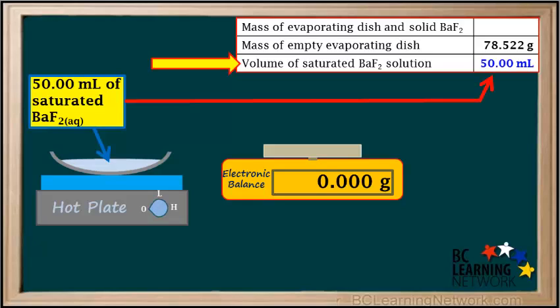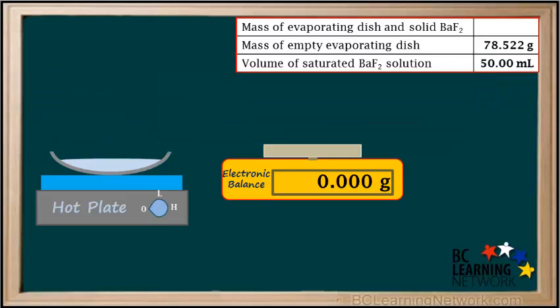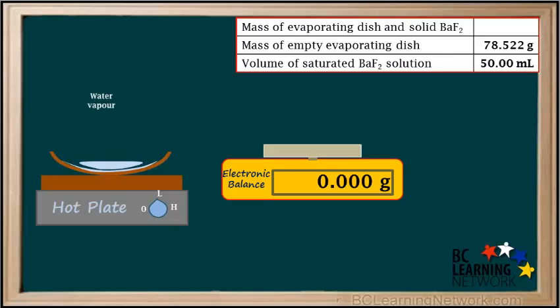We record 50 milliliters as the volume in the data table. Now we turn the hot plate on at a low setting and let it warm up. The water slowly evaporates, leaving a small amount of solid residue in the evaporating dish.